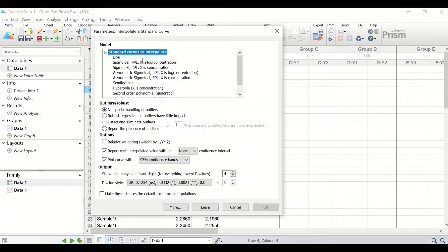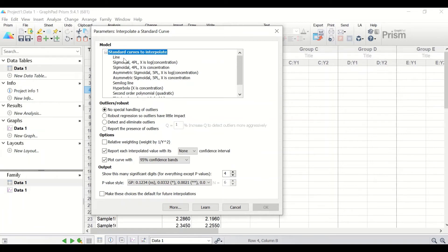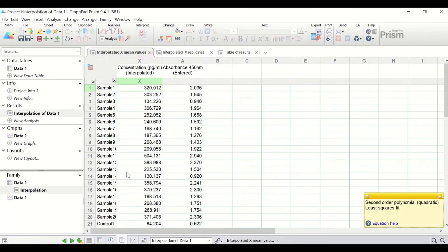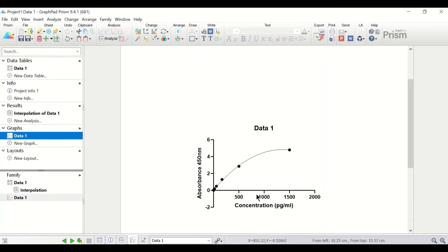In the new window, select the standard curve to interpolate. Since the scatter shows a non-linear relationship between the absorbance and the concentration, we have the option of choosing second order polynomial (quadratic) or hyperbolic. As shown by the scatter plot, select second order polynomial quadratic and click 'Plot curve with data.' Click OK. A curve is fitted for the standard samples, showing a bent quadratic polynomial second order curve.